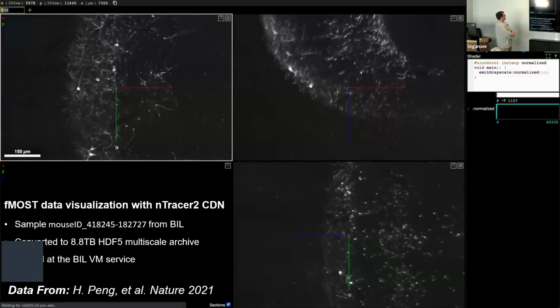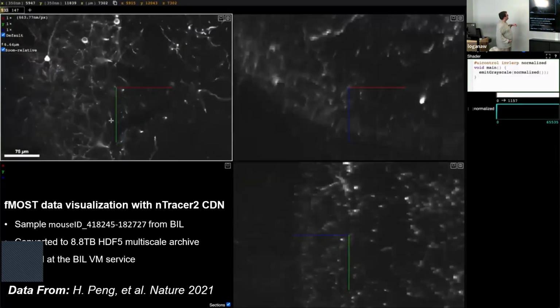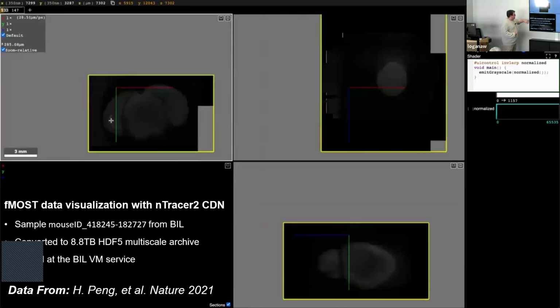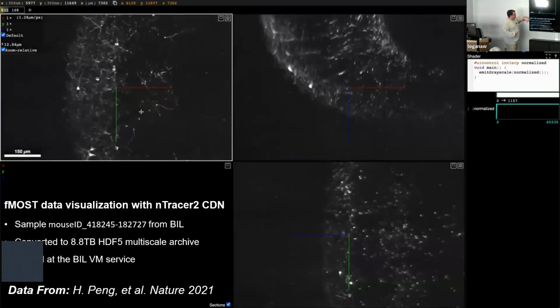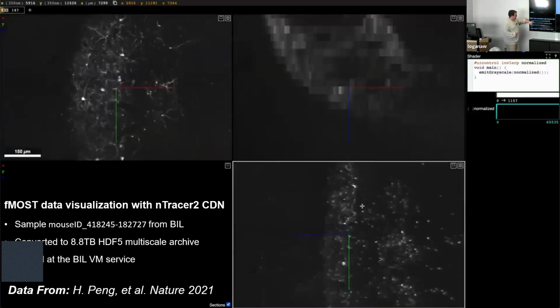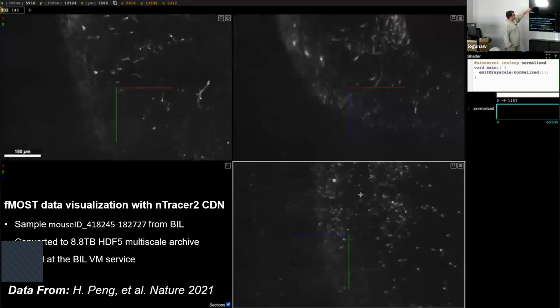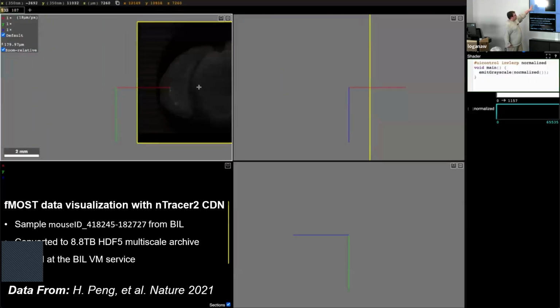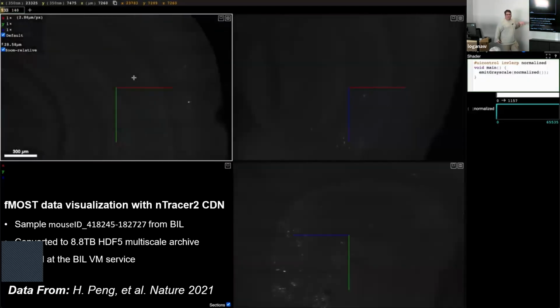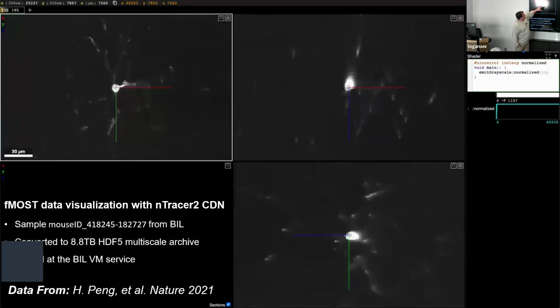And so what this looks like all put together, and I apologize because the video is very compressed for some reason. This is an 8 terabyte data set from one of the Nature papers that I cited at the very beginning of the talk, an 8.8 terabyte whole brain mouse image. And as you zoom around in this interface, this is that Google NeuroGlancer interface that I mentioned, you can see that the image gets higher and higher resolution as it loads in.